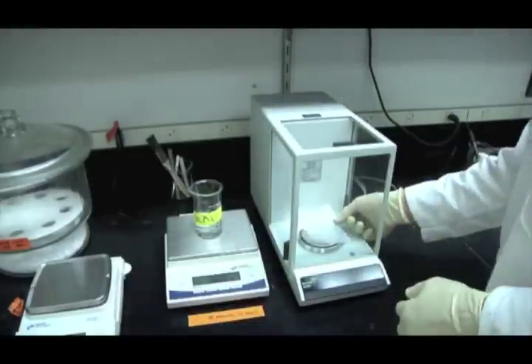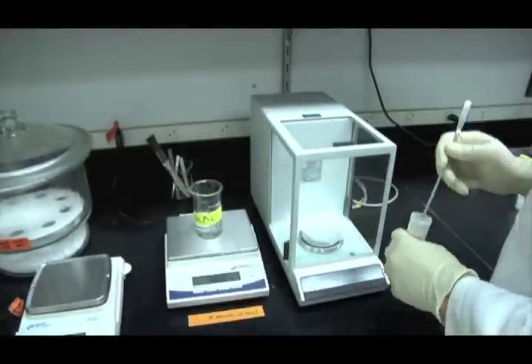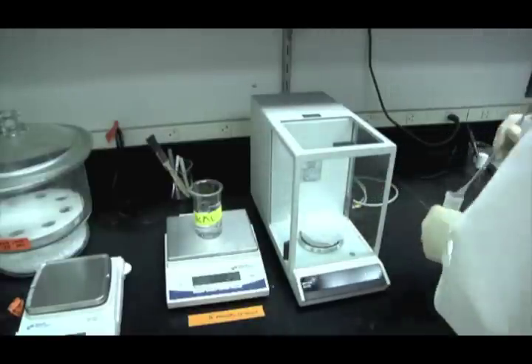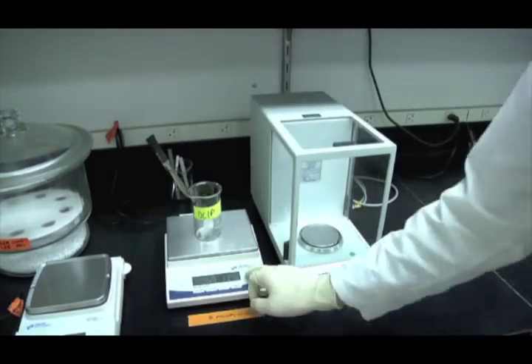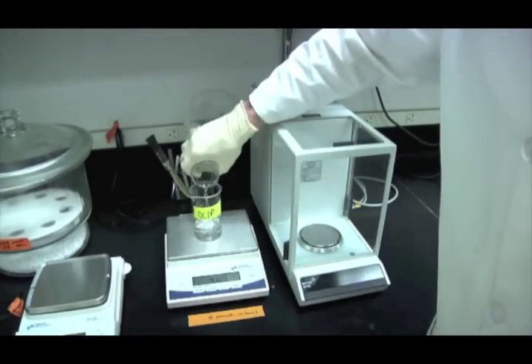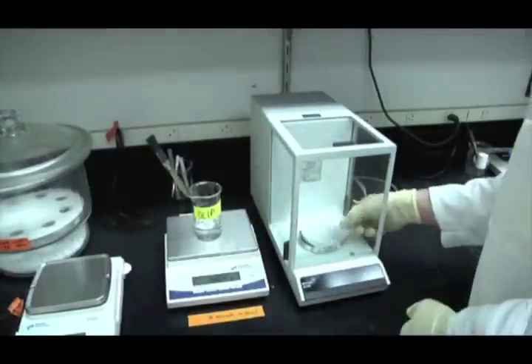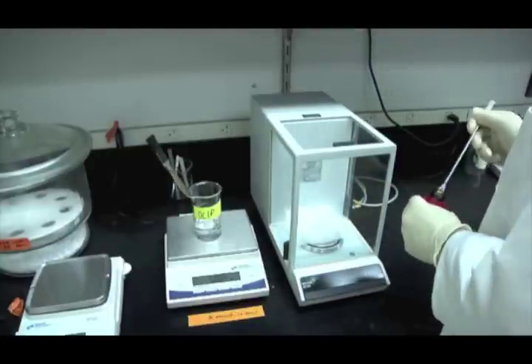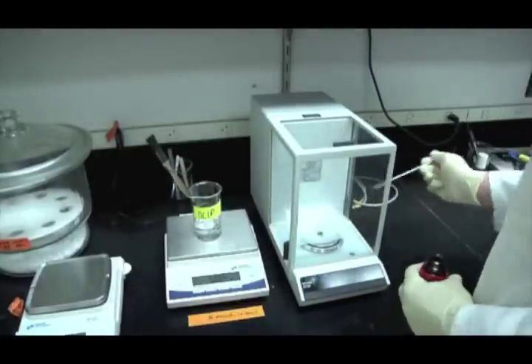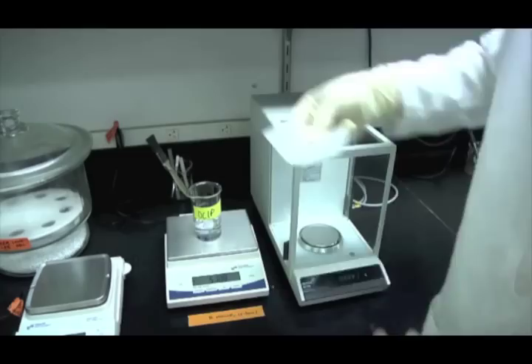Next, a 10 to the negative 4 molar solution of DCMU was prepared by combining 3 milligrams of DCMU with 50 milliliters of water. A 4 times 10 to the negative 4 molar DCIP solution was prepared by combining 6 milligrams of DCIP with 50 milliliters of water. These solutions are used as an inhibitor of photosynthetic electron transport and as an indicator of photosynthetic electron transport, respectively.